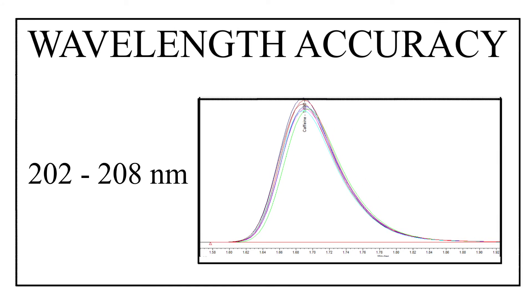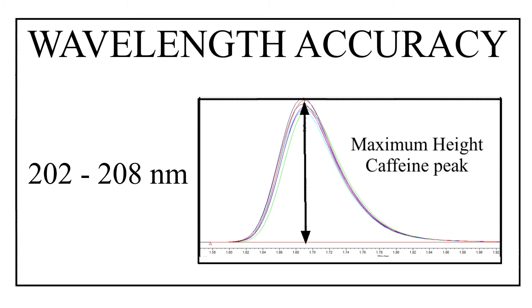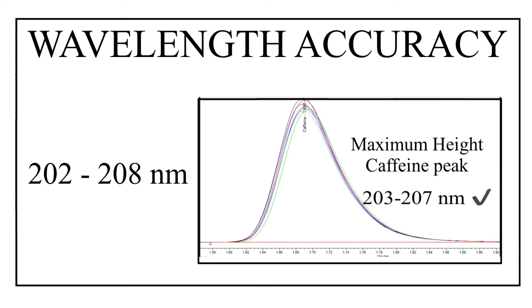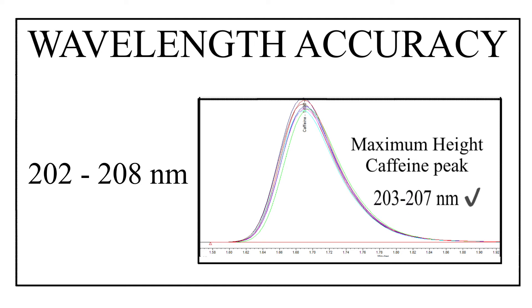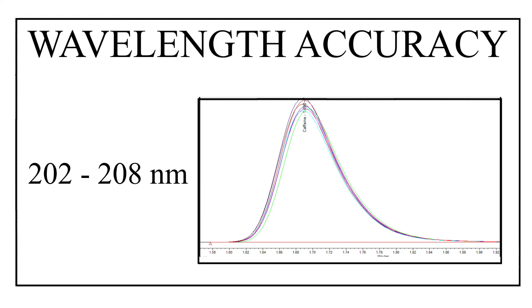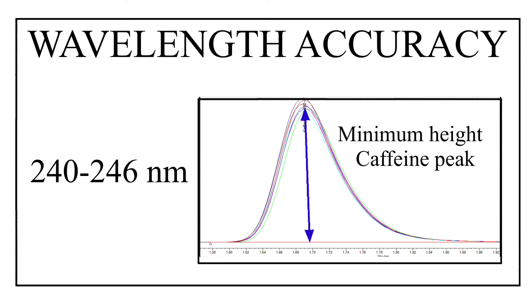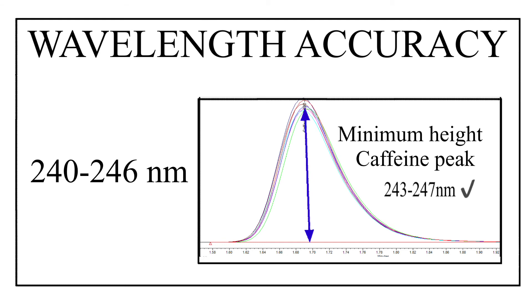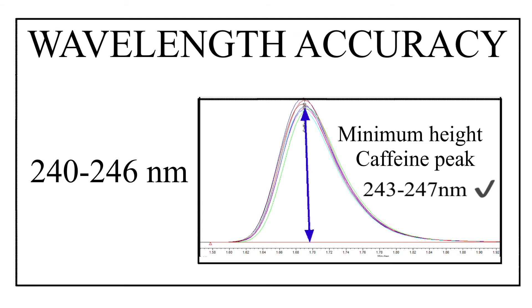Chromatograms obtained from 202 to 208 nanometers are checked for the caffeine peak with the maximum height — it should be between 203 and 207 nanometers. If you get a caffeine peak with maximum height in that range, the test is considered pass for the first set. For the second set, chromatograms from 240 to 246 nanometers are checked for the caffeine peak with minimum height — it should be between 243 and 247 nanometers. If so, the test is considered pass for the second set.